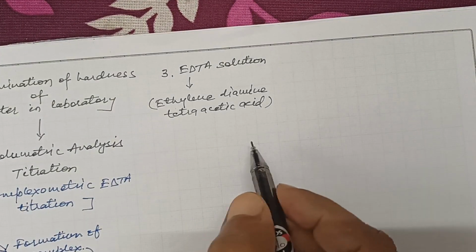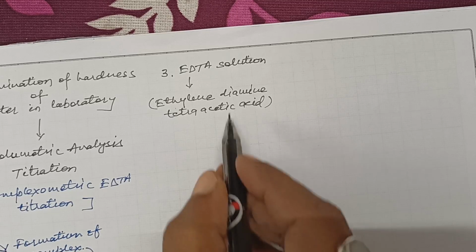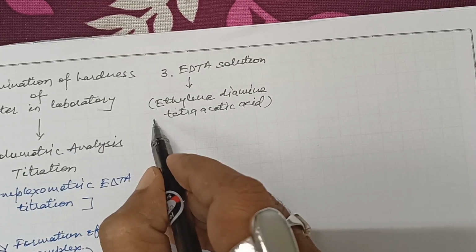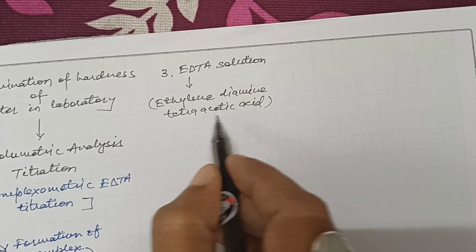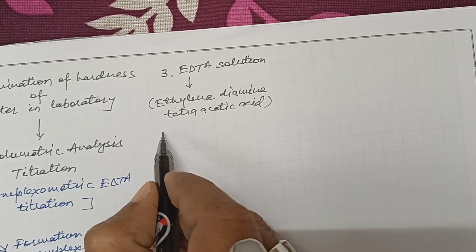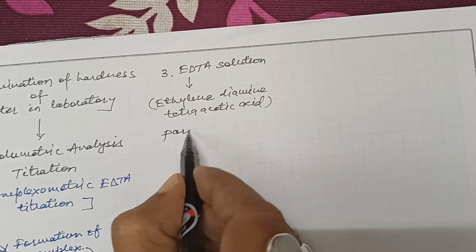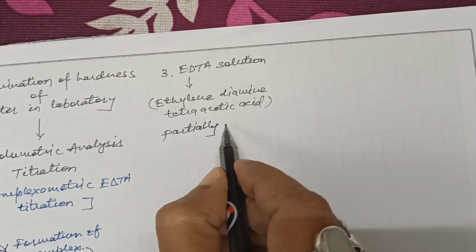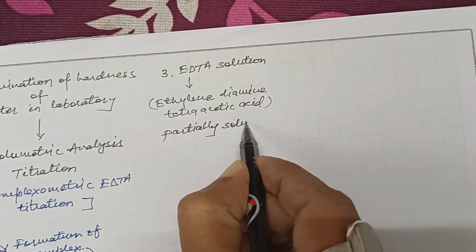But generally this EDTA, ethylene diamine tetraacetic acid, is sparingly soluble in water.